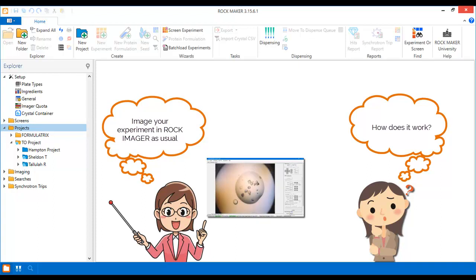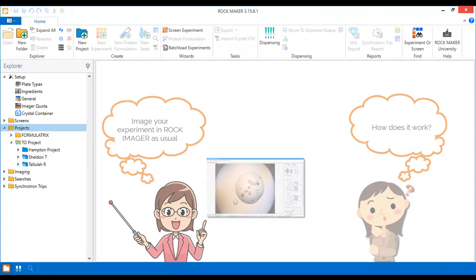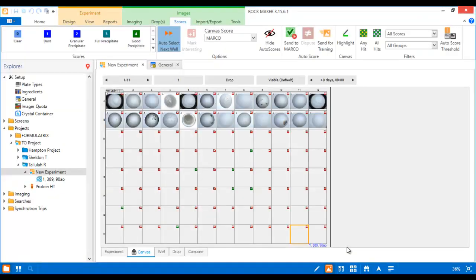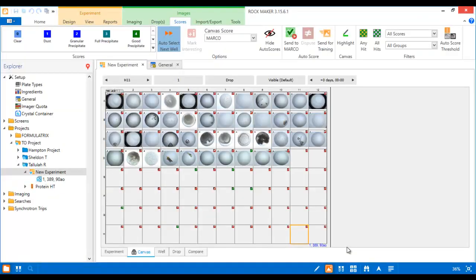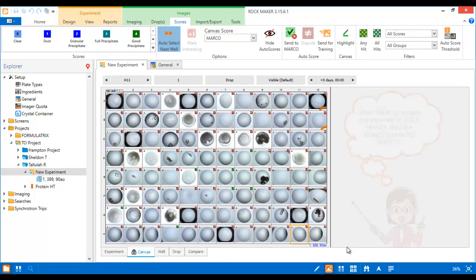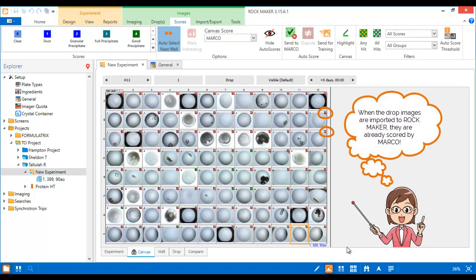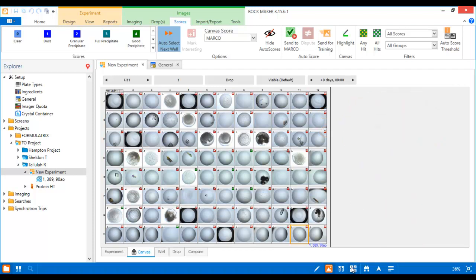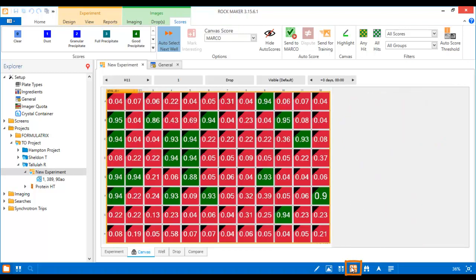As new images are imported back to Rockmaker after an imaging session in Rockimager, you will almost immediately see the Marco scores on each of the drops in the upper right corner of the image. You can switch to Score View to see the scores more easily. The numerical score given by Marco represents the probability of the image containing a crystal.